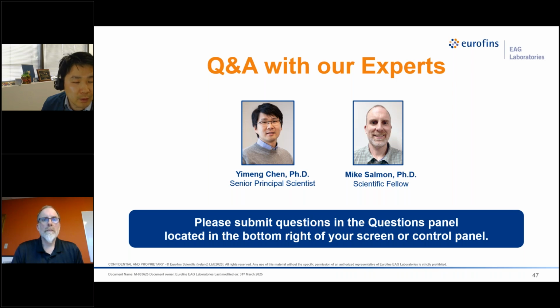energy as possible. And also, when you prepare the sample, it's preferred to have a larger tip at the bottom that gives enough heat dissipation to improve the mass resolving power in the laser pulsing mode.